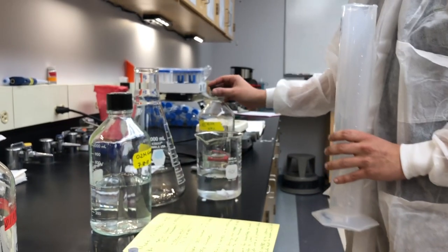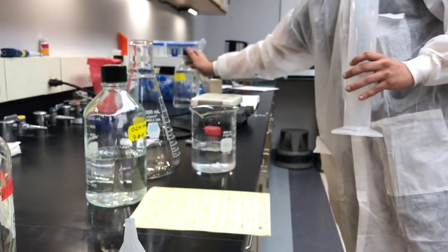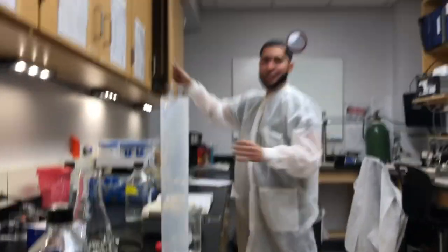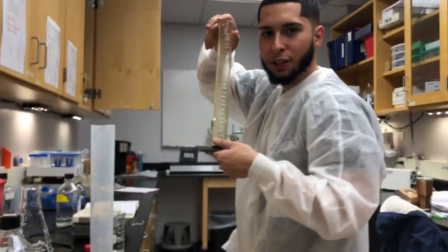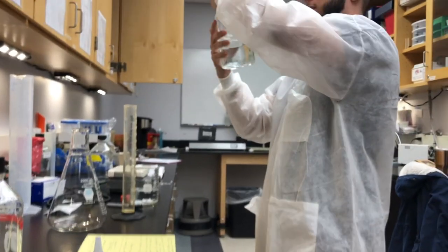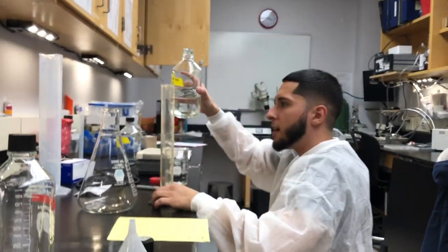Now we're going to get 195 milliliters of our monobasic, and we're going to use a smaller graduated cylinder for this one, just because it'll be easier to know exactly how much you have. So we're going to pour 195 milliliters of monobasic.